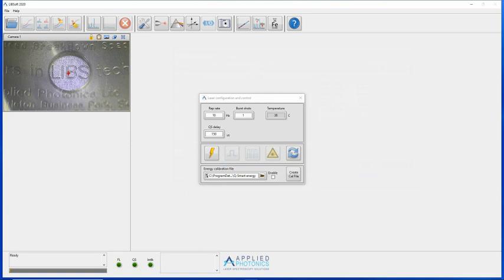The path to this file will be automatically entered in the laser configuration window. The use of the calibration can then be enabled by ticking this checkbox. A laser energy control will then be displayed, and the flash lamp Q switch delay control will be disabled and greyed out. Changing the laser energy directly will now automatically update the value of flash lamp Q switch delay.